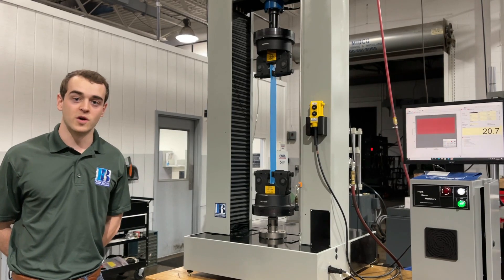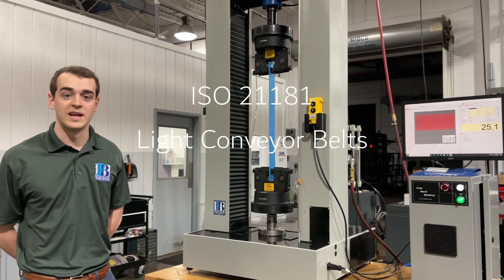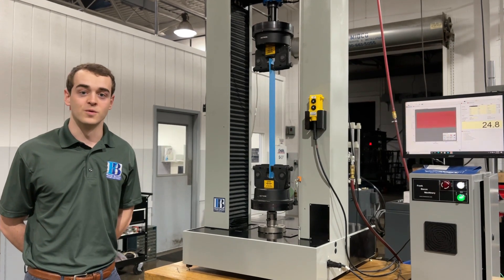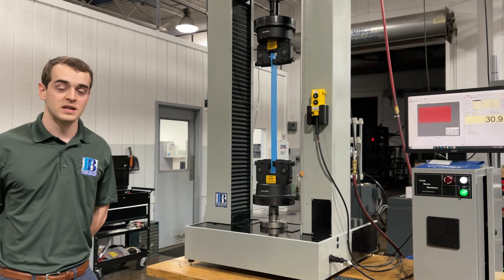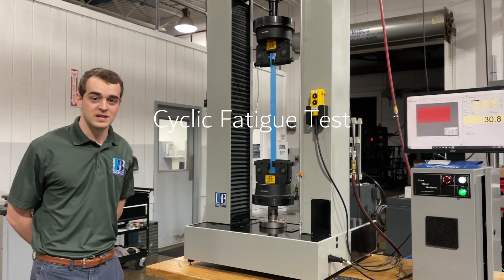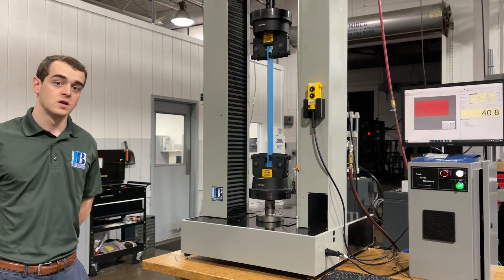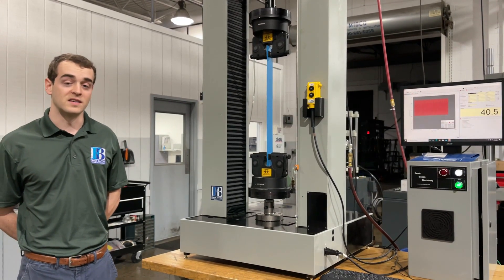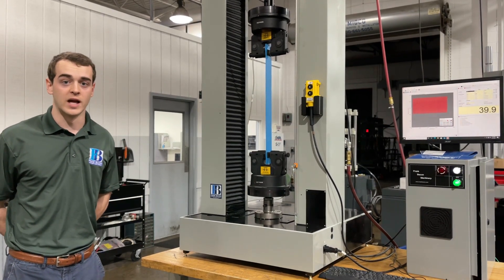We had a customer come to us looking to do a specific ISO standard — ISO 21181 — specific to conveyor belt materials. It is a cyclic test; we were running 500 cycles at 0.5 Hz, extending that sample 1-2% of its original length.